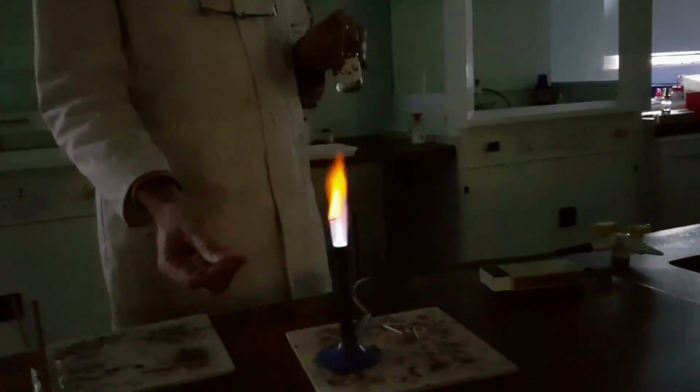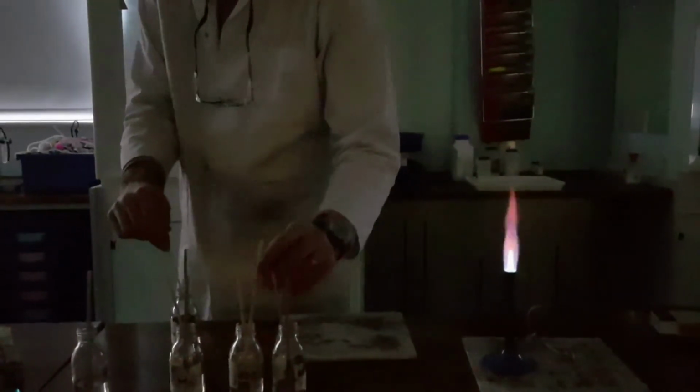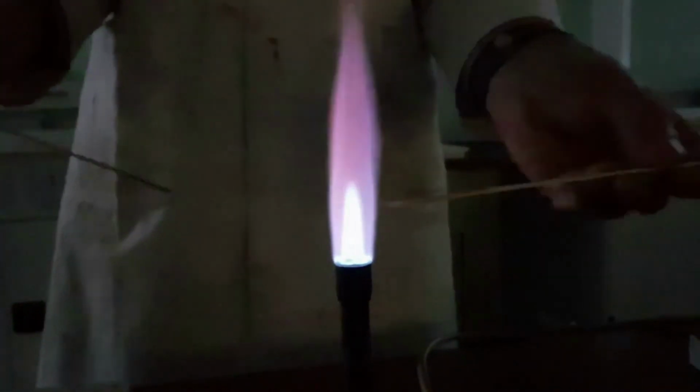What I might ask Mr. Reeves to do is to take a splint from both the calcium and the sodium together and hold them in opposite sides of the Bunsen flame so that you can hopefully see the difference between the two colours. So the sodium is a lot brighter and is a lot more yellow. The calcium is a redder orange colour.